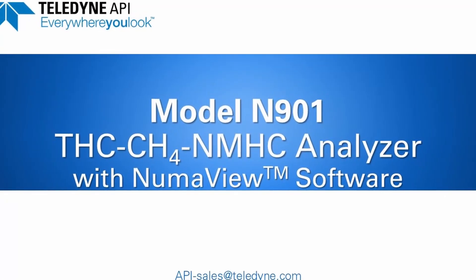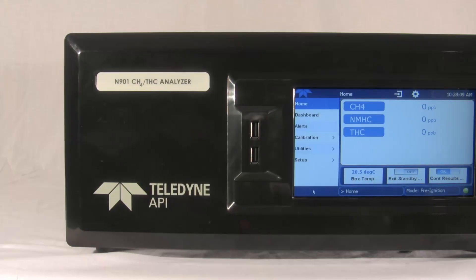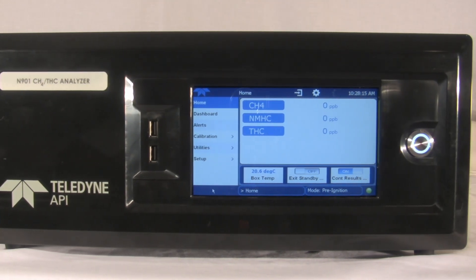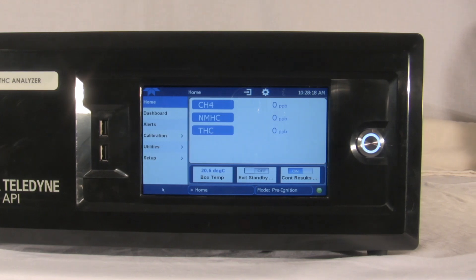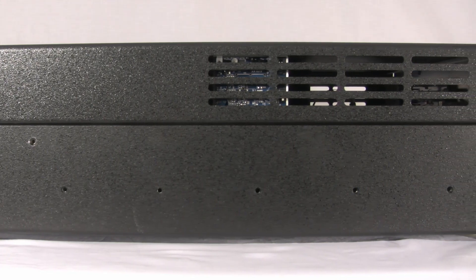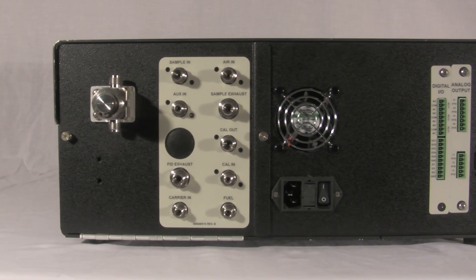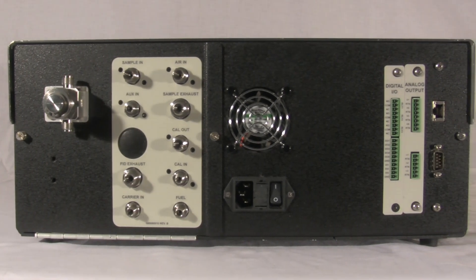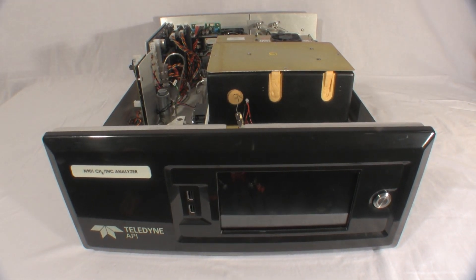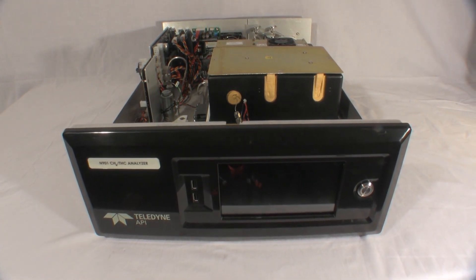Introducing the Teledyne API N901 methane non-methane analyzer, featuring a modern Numaview software interface and robust electronic architecture utilizing all DC components and modular subsystems. It comes in a 19-inch 4U rack mount standalone cabinet measuring 24 inches deep, with stainless steel pneumatics and flexible IO options. A mature flame ionization detector combined with gas chromatography provides a 25 ppb lower detectable limit with a range up to 1000 ppm.